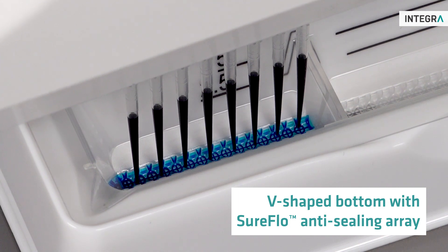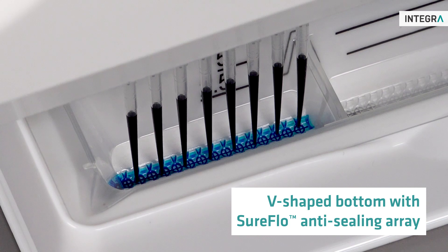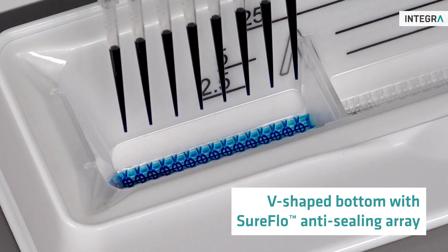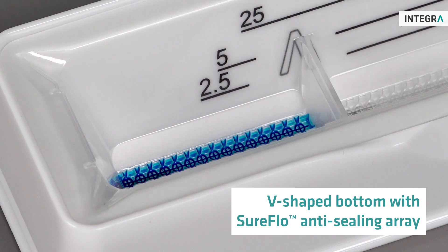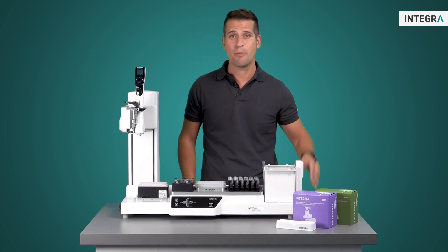The aspiration is now finished and you'll notice all tips are filled with liquid. Each channel aspirated 12 microliters, giving us a total of 96 microliters successfully aspirated, and only 4 microliters is left as residual dead volume.